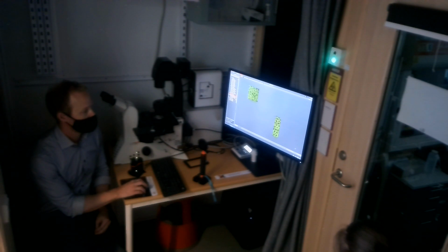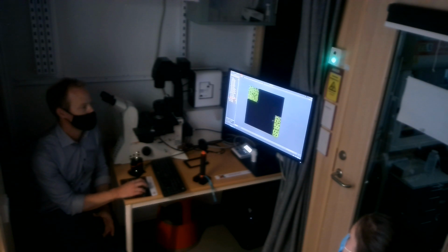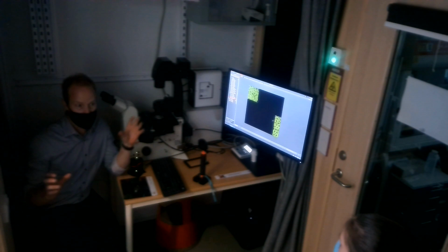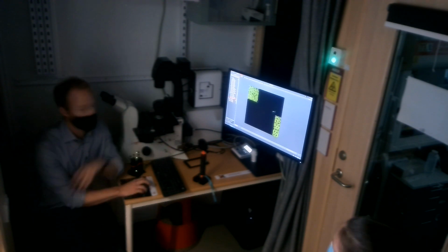And I can now merge these two. If I merge it like this, I'm getting this image. It just fills up with black: it merges these two individually, and then it puts black in between. So I have an image now where I still have information about where they were in relation to each other, how far apart they were, and so on. So that could be of interest.